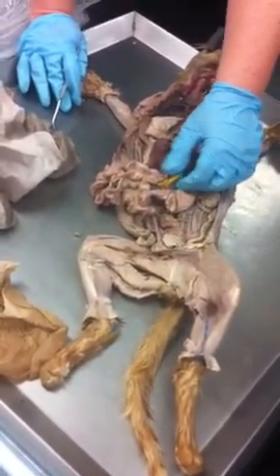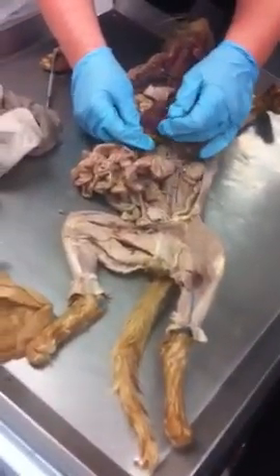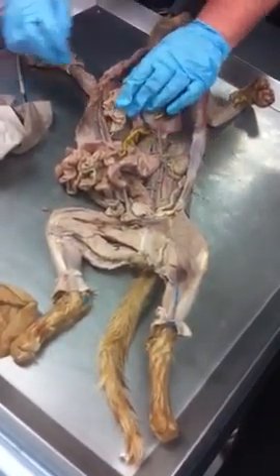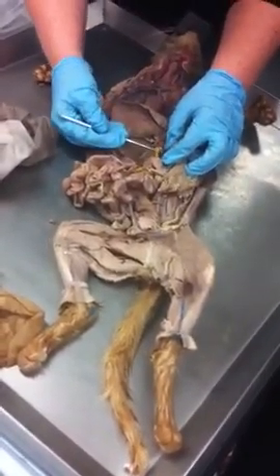It becomes a bigger, larger vein, and it's getting all sorts of veins from all these intestines. I snapped the splenic, so that's what that little piece is right there, and we can see it on the other cat, so that's where I broke it. But above that is where it's now going to be the hepatic portal vein, and that's going to go up into the liver. So above those branches, now it's the hepatic portal.